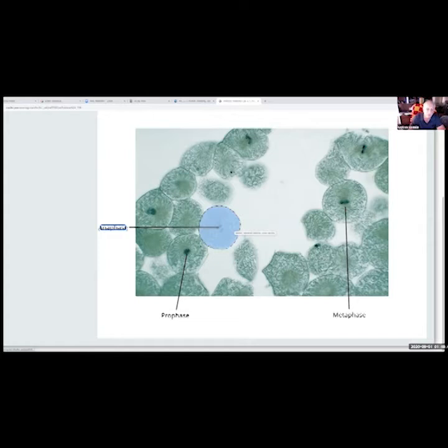And if I pick the cell here, where my pointer is, at the top of the screen, what would you say this one is? Metaphase? I would agree, yep. And this one here? Also metaphase? I would accept metaphase or early anaphase.